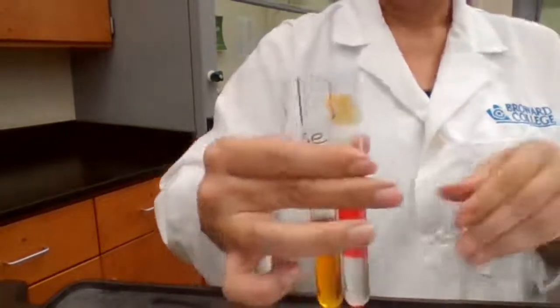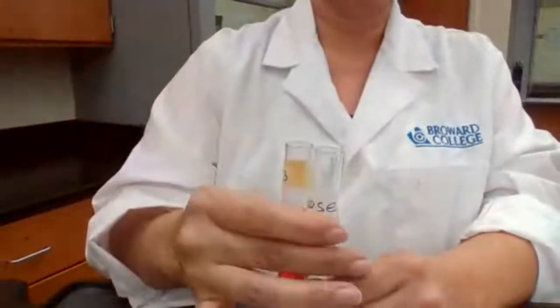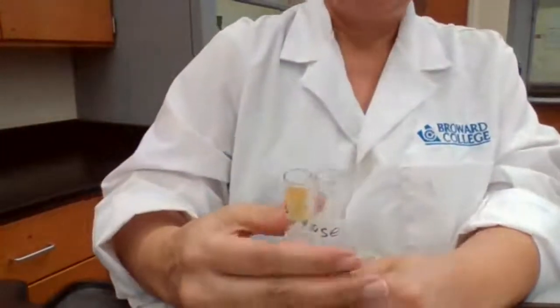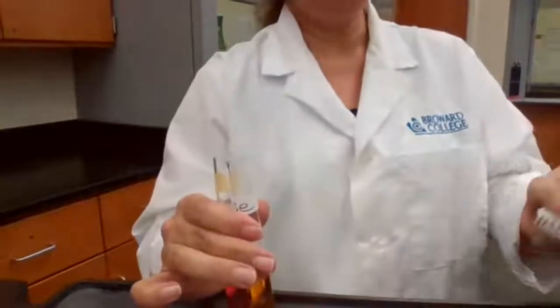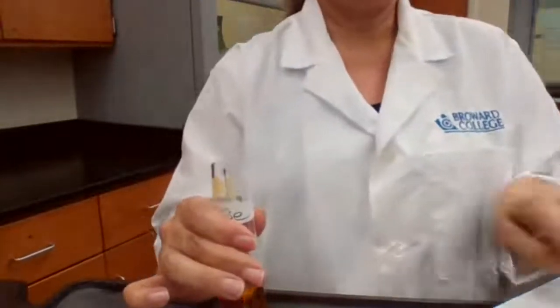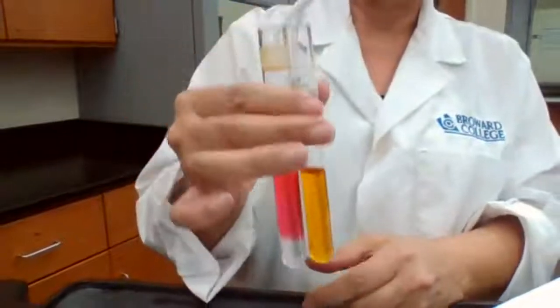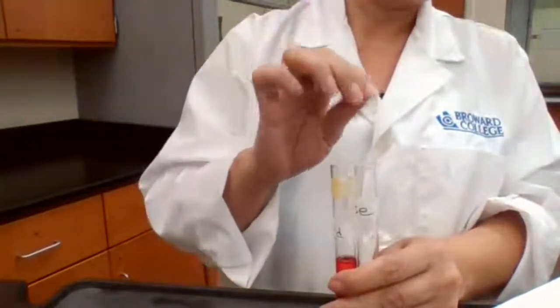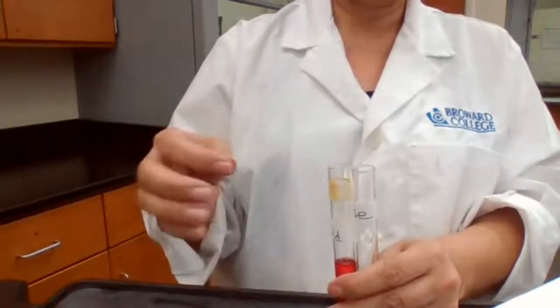Now, what's the purpose of this part of the experiment? It's trying to tell you how the indicator, which is HIn, is going to be affected in acidic solution and in basic solution. So basically, the reaction at equilibrium is your HIn(aq) that gives you H+ and In-.